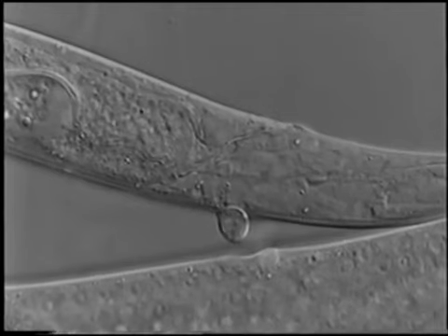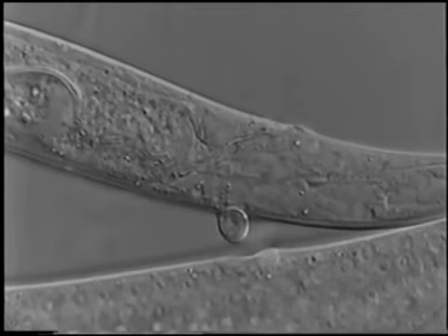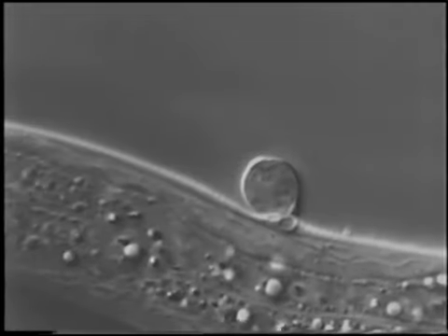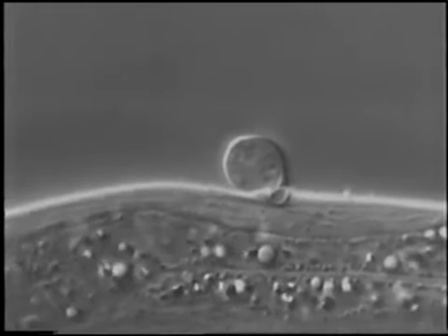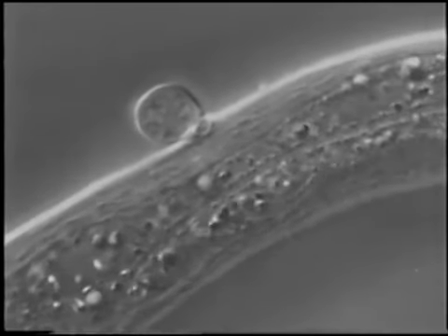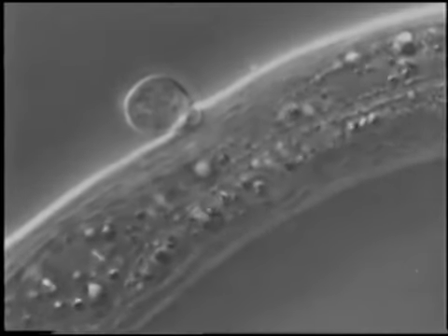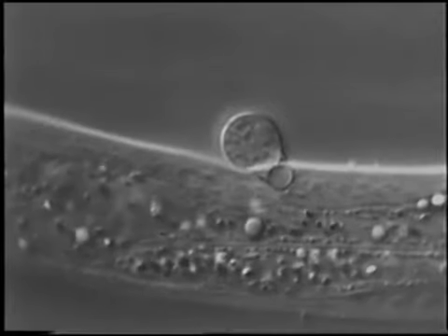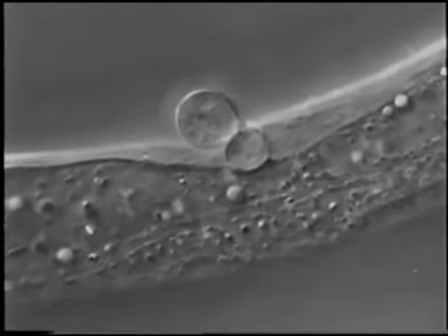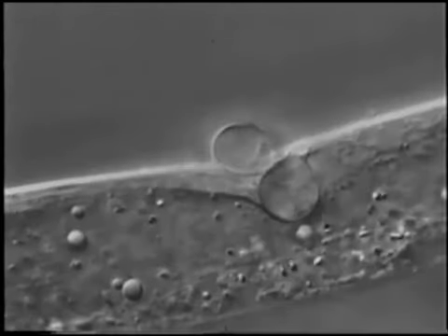The infection process is now followed in optical section. Within 2 hours after contact, an infection bulb develops. Note the very thin penetration tube. The infection bulb continues to grow until, after a further 1.5 hours, it becomes as wide as a branch cell.